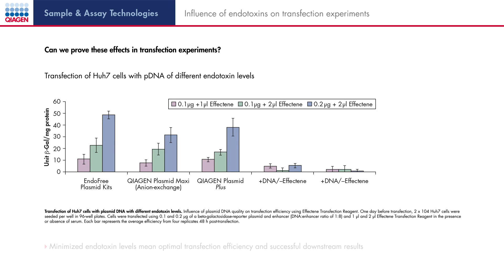To measure the efficiency of transfection, pCMV-beta including the beta-galactosidase gene was transfected into highly passaged human hepatoma cells. Beta-galactosidase activity was measured using the beta-gal assay. As shown in the figure, we can observe a correlation between different parameters: quality of DNA, amount of DNA, and amount of transfection reagent. The figure shows that endotoxin-free DNA gives the best result in different experiments, but the DNA amount and amount of transfection reagent also play a significant role. The optimal ratio must be calculated.